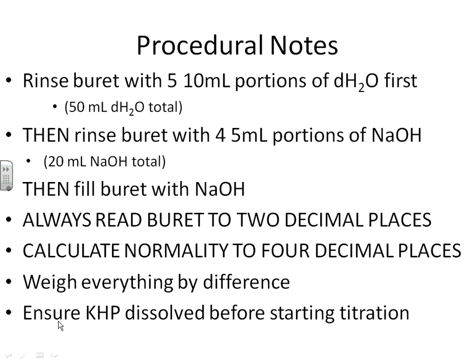And just to touch on the point, boiled distilled water. Why are we using boiled distilled water? Well, first of all, we're using distilled water because tap water has too much junky junk in it, and this is a very precise lab. We need to be very careful about the procedure, and there's too much other stuff in tap water for us to consider even using it.